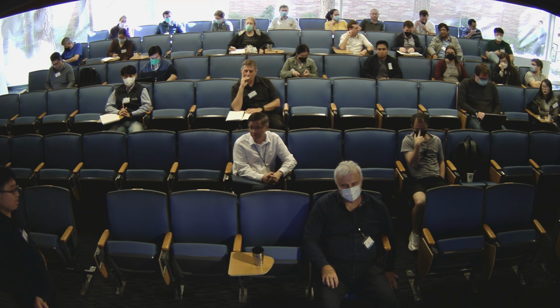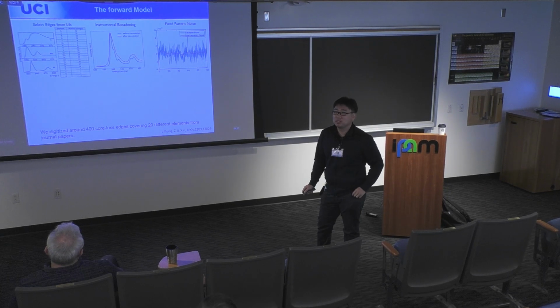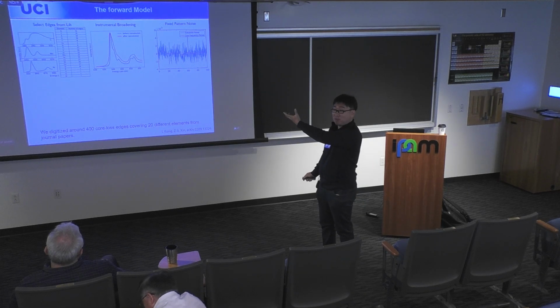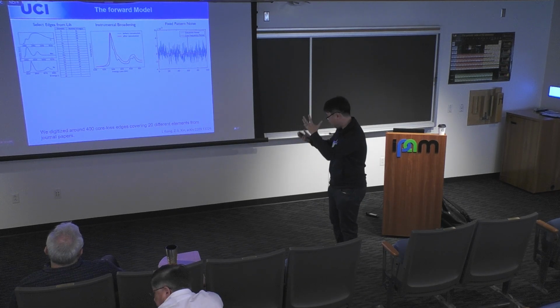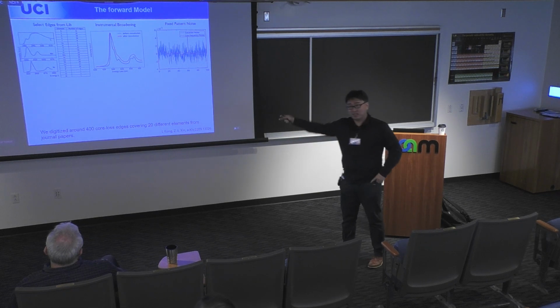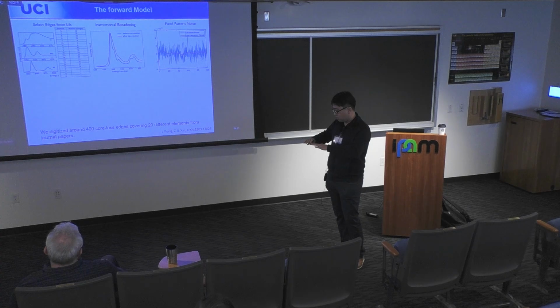With a direct electron detector, if the normalization is not done correctly, it could also give you fixed pattern noise, but not as much as this. This is really the optical fiber coupling, and you can't do a correct gain normalization, and never on a dedicated STEM. That will give you this problem. And also when your intensity is really low, electron counts are really low, the fixed pattern noise actually shows up because the normalization cannot be done correctly, right?